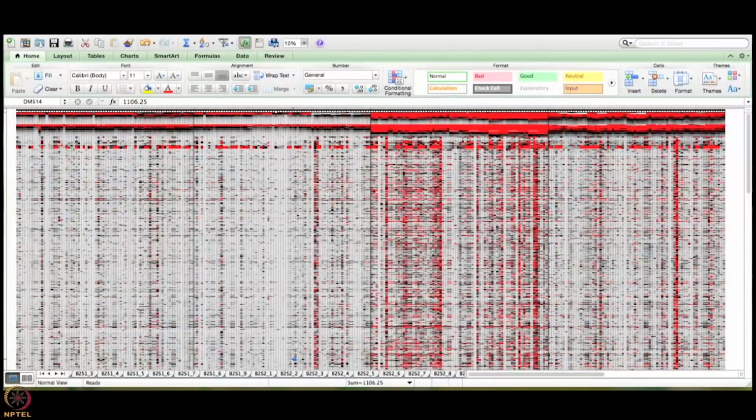So you can see in this slide here, basically what I have done is I have just minimized this Excel a little bit, so you'll be able to see all 4 batches at once. I don't know if you can see a black line here. Basically this is going to split your set 1 from set 2 of the first batch and set 1 from set 2 of the second batch.